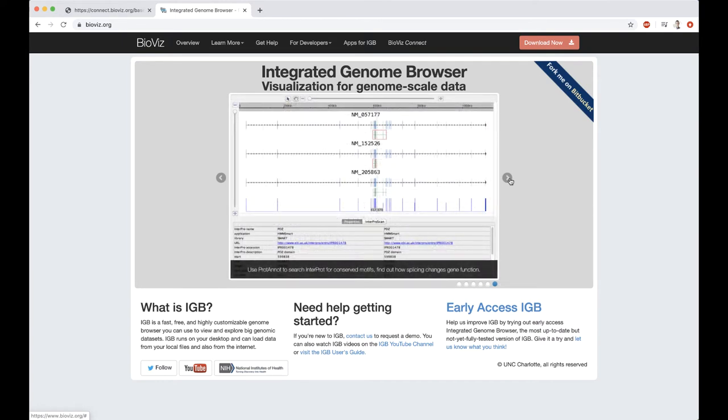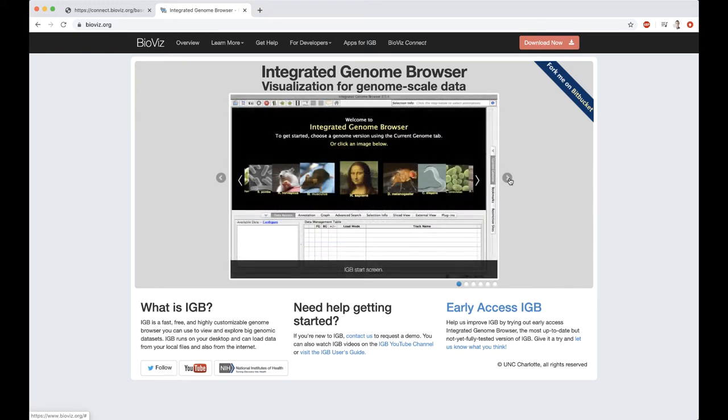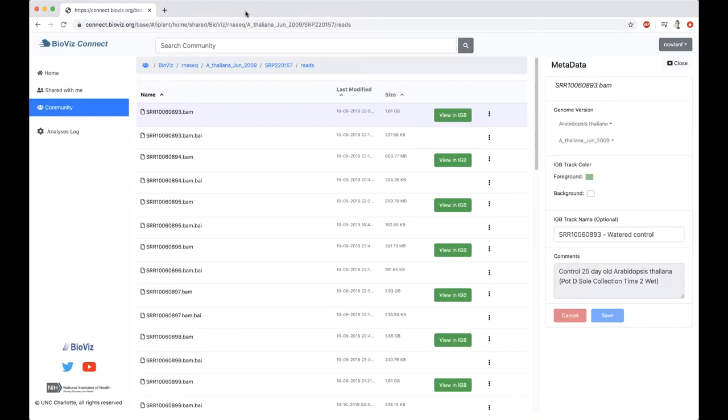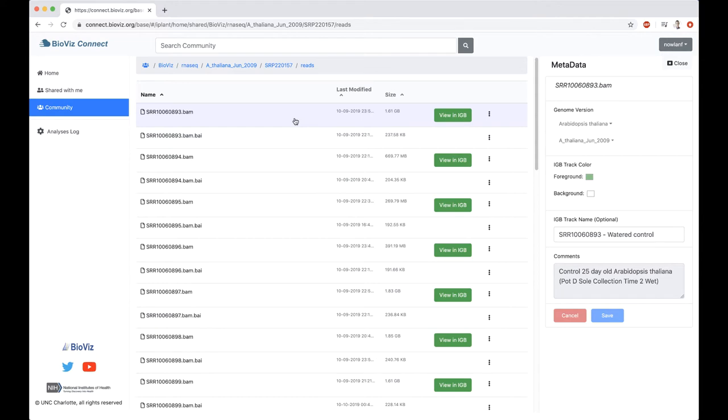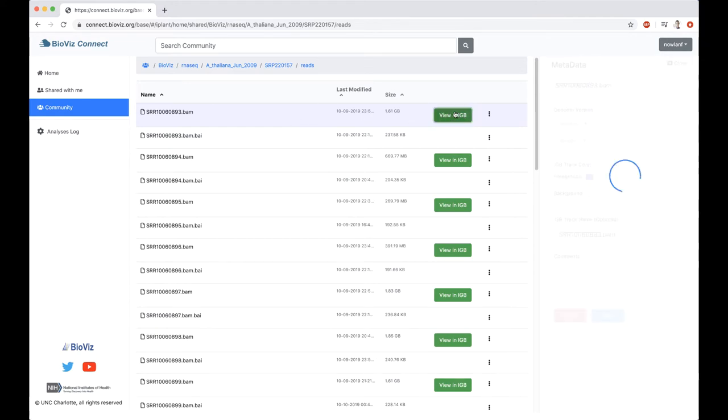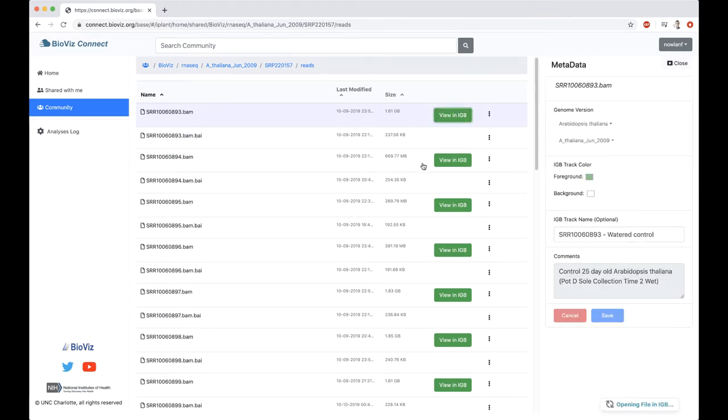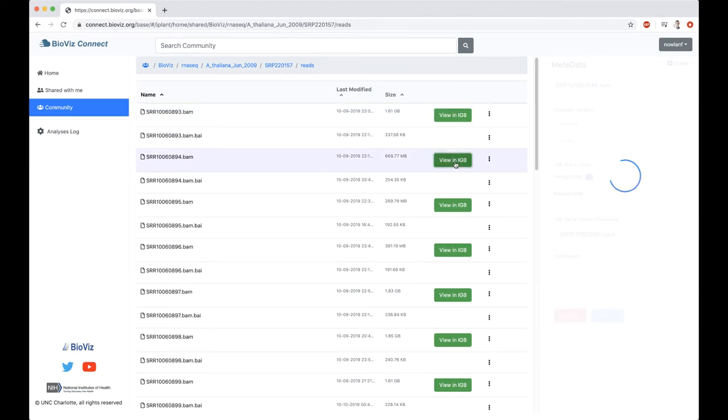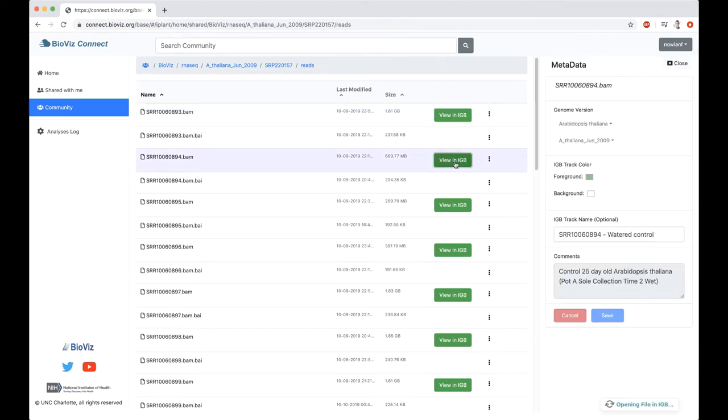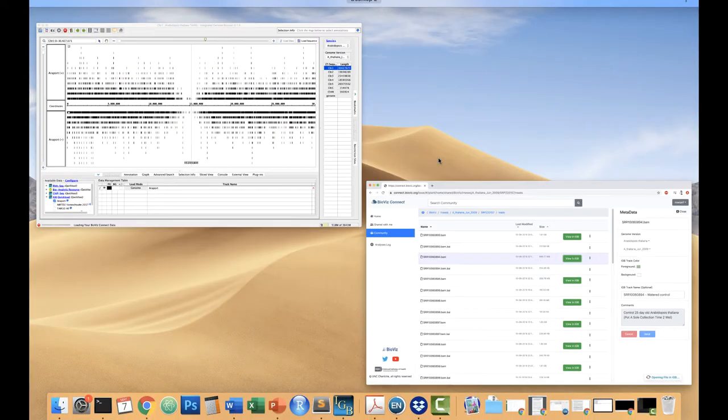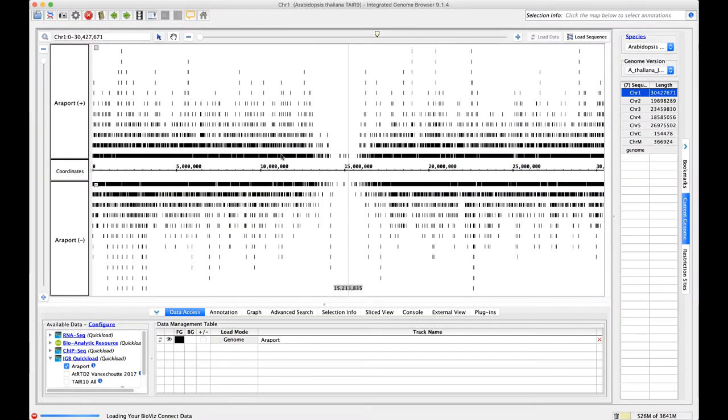IGB allows for visualizations of lots of the most well-known bioinformatics and genomic data sets, such as BAM files, BED, GFF, that kind of thing. Studies like ChIP-seq, RNA-seq, whole genome sequencing, all those would be viewable within IGB. I have IGB up and running, and in order to visualize this data in IGB, all I need to do is click on this View in IGB button. It's going to tell me it's opening a file in IGB, so I'm just going to do both of these files. And then I'm going to jump to my IGB.